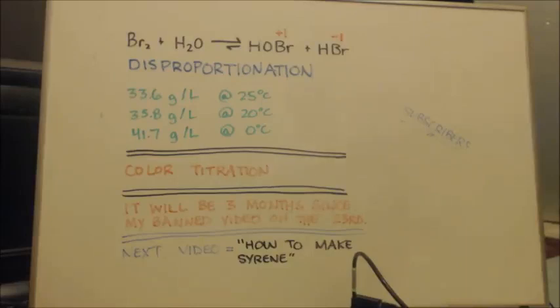But I have an idea of how much is in there, you know what I mean? And then I would use that to get a volume that I need, that's close to what I need. And then when I do the actual experiment, I can just color titrate. When it stops turning clear and it remains red, the experiment is over. The reaction is over, okay?